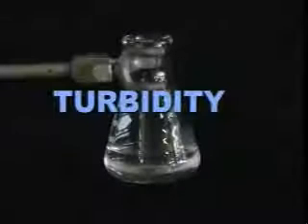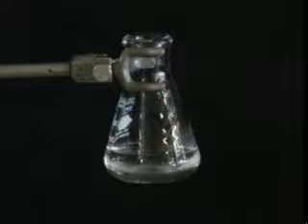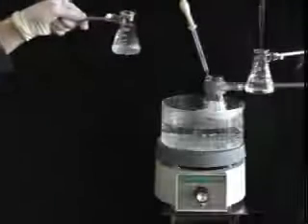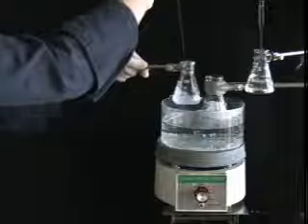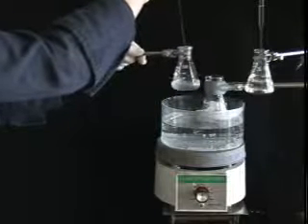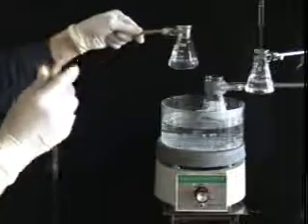And do not confuse cloudiness with the turbidity that is observed upon mixing two solvents together. Once you have obtained a persistently cloudy solution, add hot solvent 1 dropwise until the solution just turns clear. Now you're ready to set the solution aside to cool.